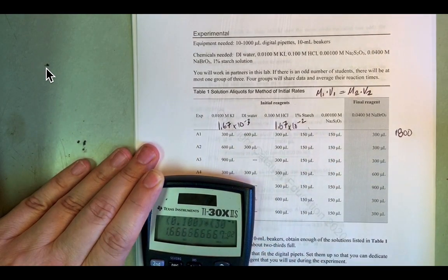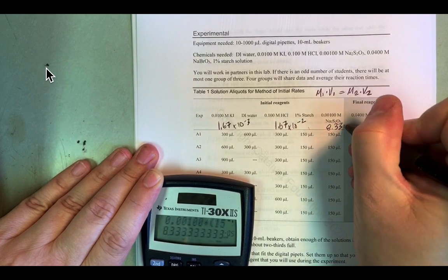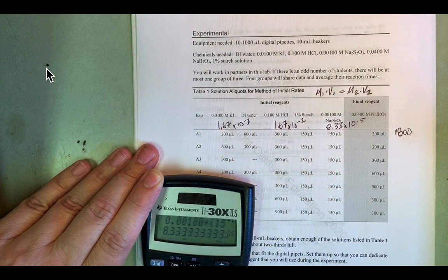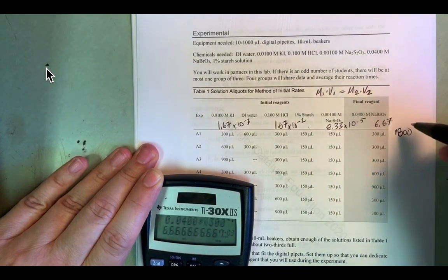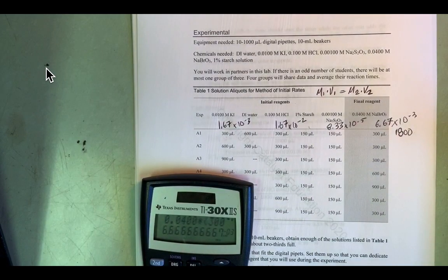All right, this one, 0.00100 times 150 divided by 1800 is 8.33 times 10 to the minus 5. And then finally this bromate reagent that we have here: 0.0400 times 300 divided by 1800 is 6.67 times 10 to the minus 3. So those are the molarities of everything for the A1 experiment.